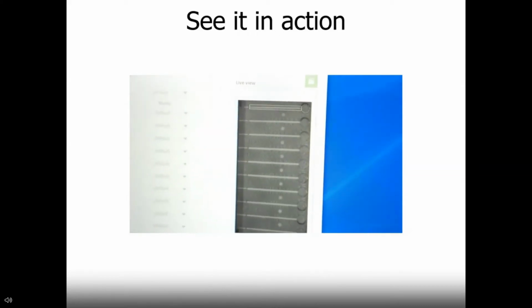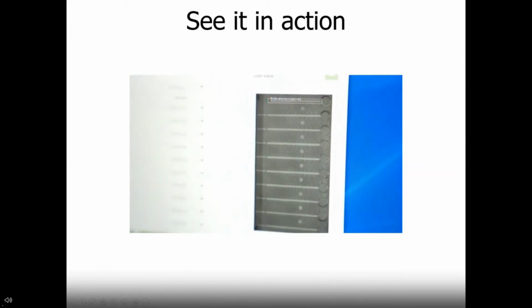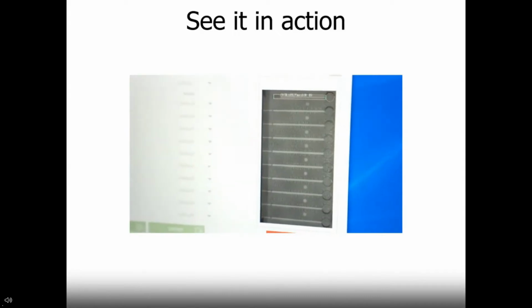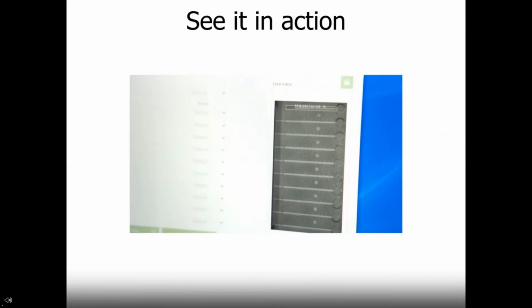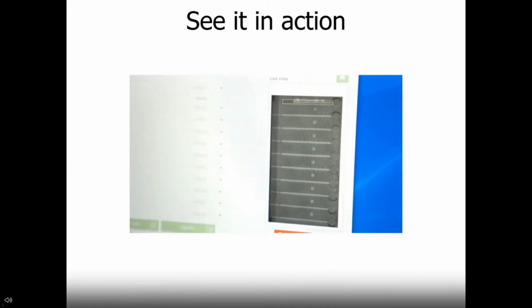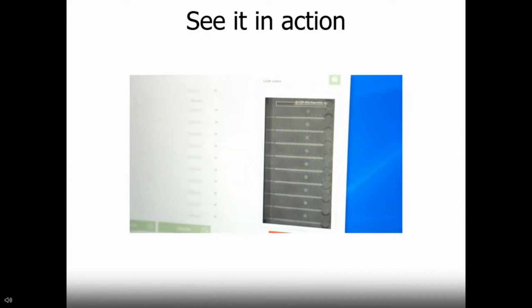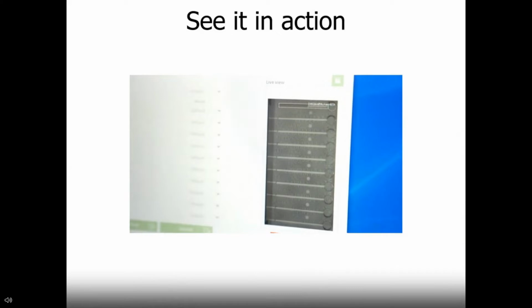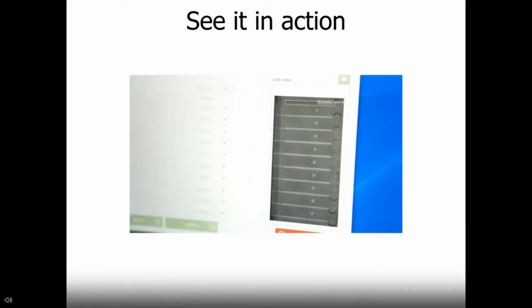After the incubation, what we'll see here on the left is that sample is going to run through the resistance channel and then start being tracked by the software, just like we saw in the earlier video on the last slide. So this whole run, because it's on a sample that is less than 10 centipoise, takes about 1 minute, and that includes the 20-second incubation that we saw. When the sample reaches that line of circles, then it's completed its run.